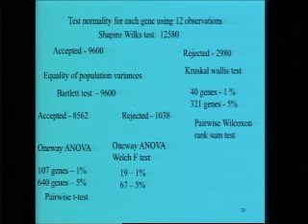For the genes where we applied the one-way ANOVA F test, we applied the pairwise t-test, and for the remaining genes where we applied the one-way ANOVA Welch F test, we applied the pairwise Welch test. So these pairwise tests tell us which genes are equally expressed in two prakrutis but distinctly expressed in a third prakruti.